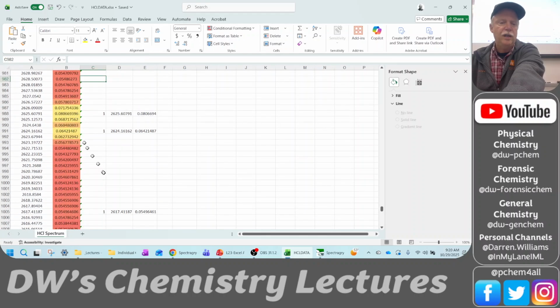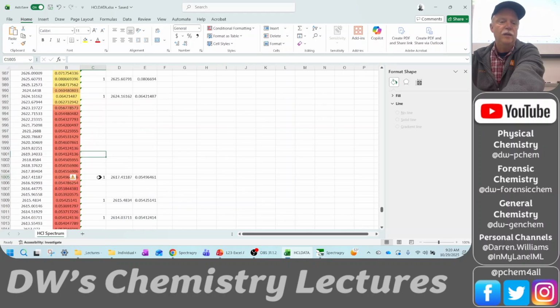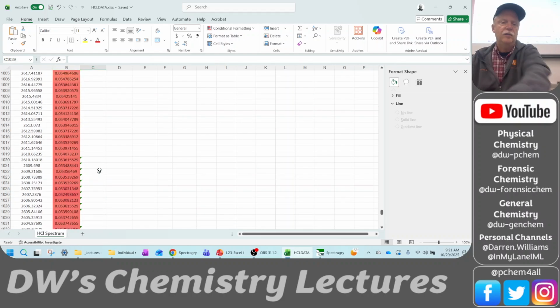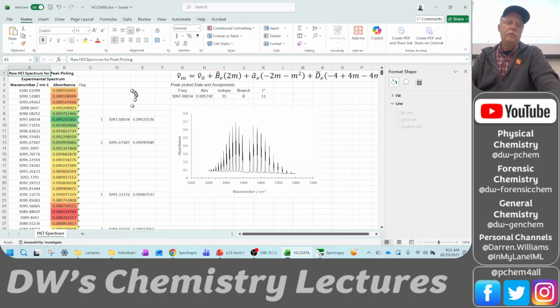See, here's two right there. Those are legit because you see the drastic change in color, right? And again, you might come up with a better trick, a better if-then statement to get those. Okay, so let's go to the top, Control Home.